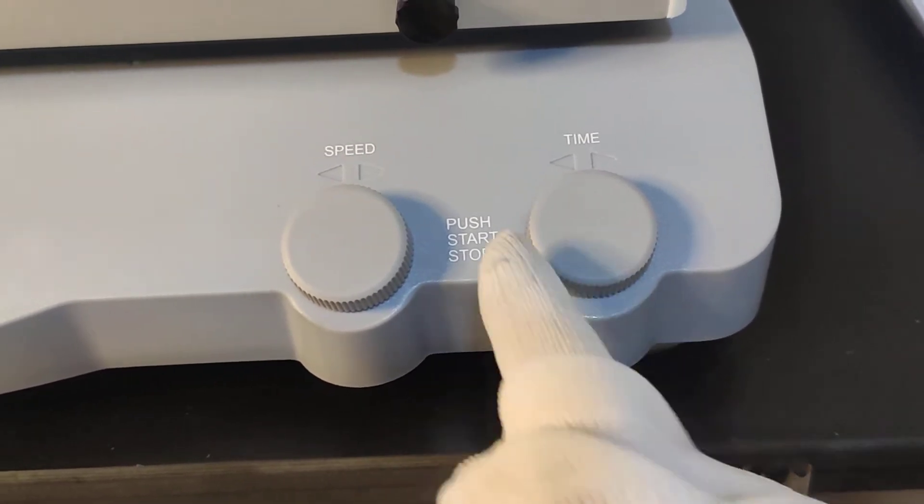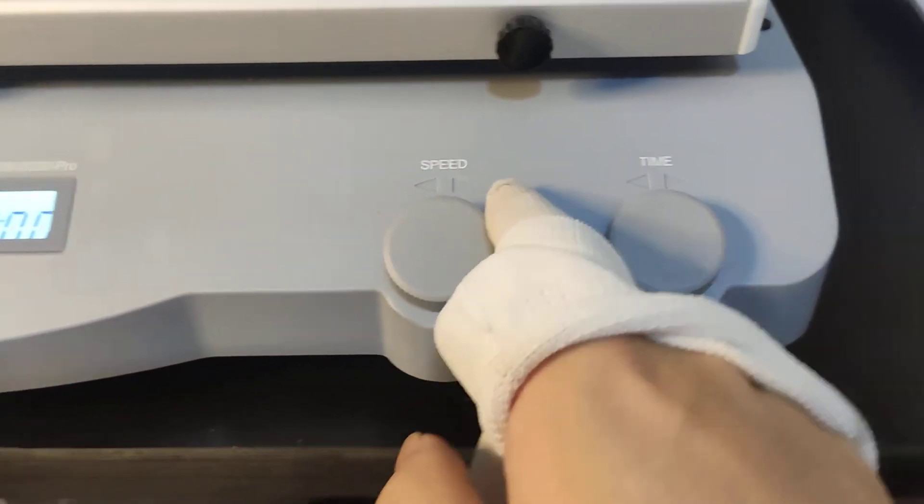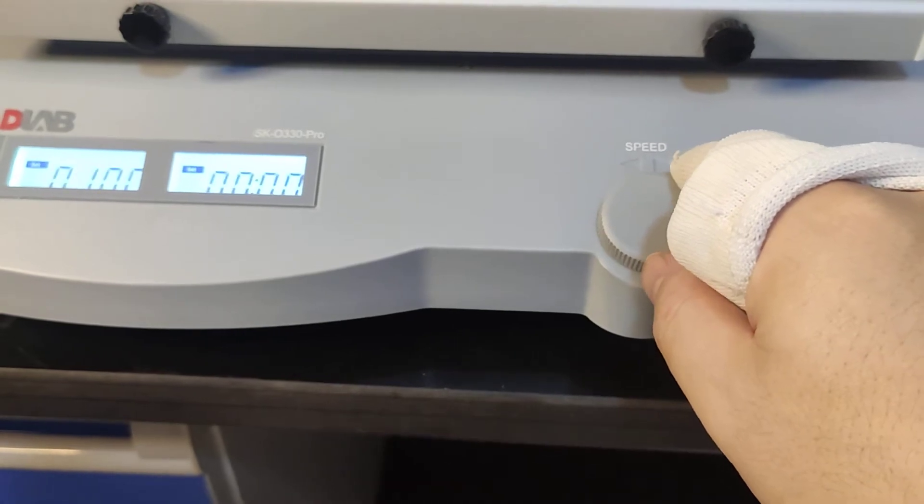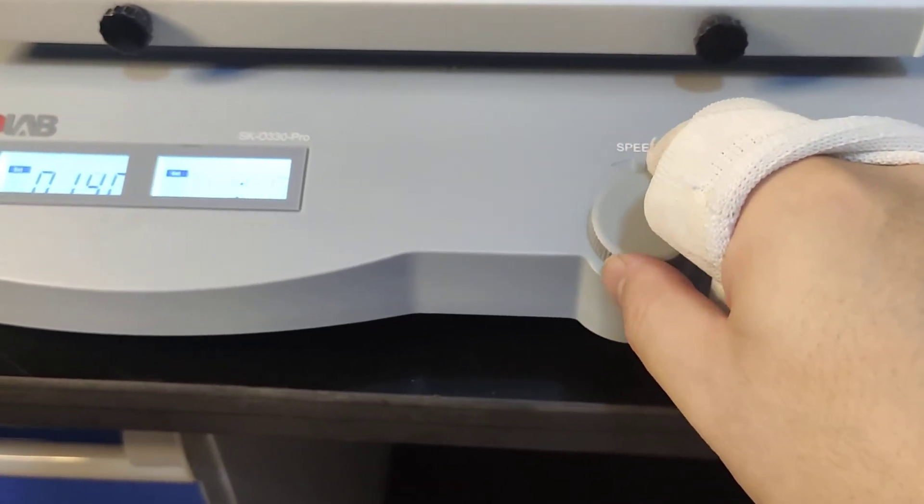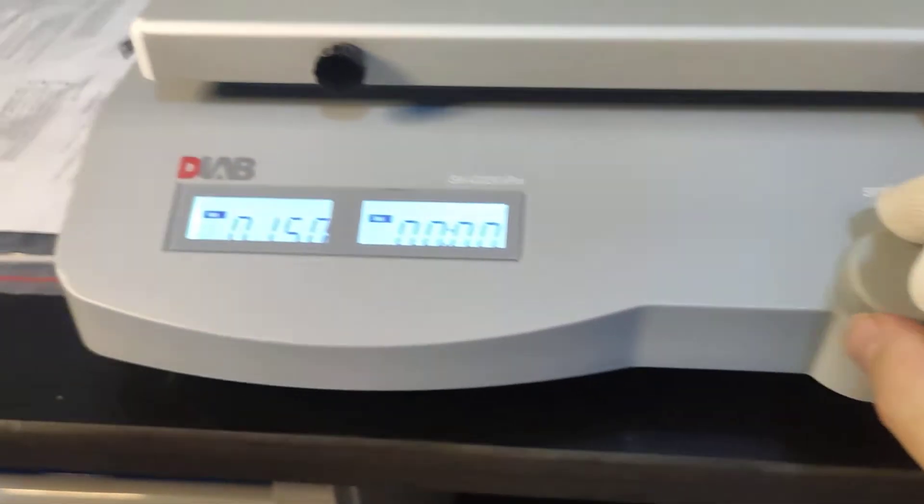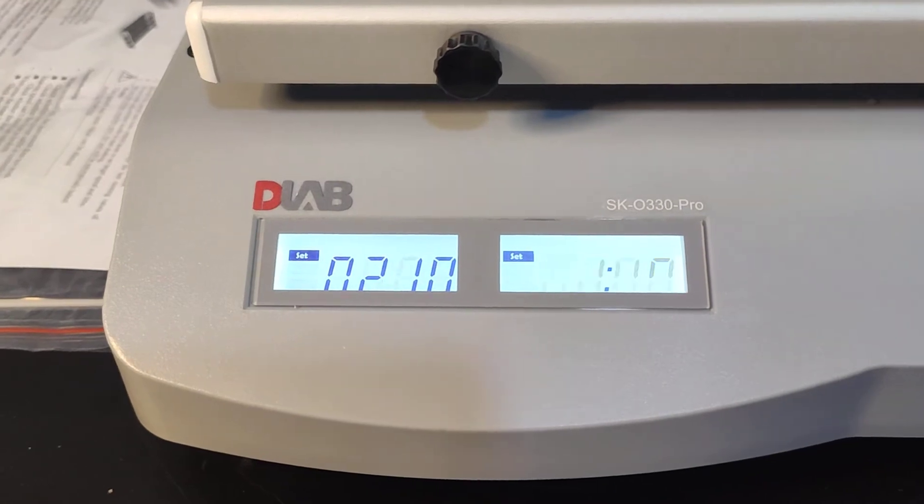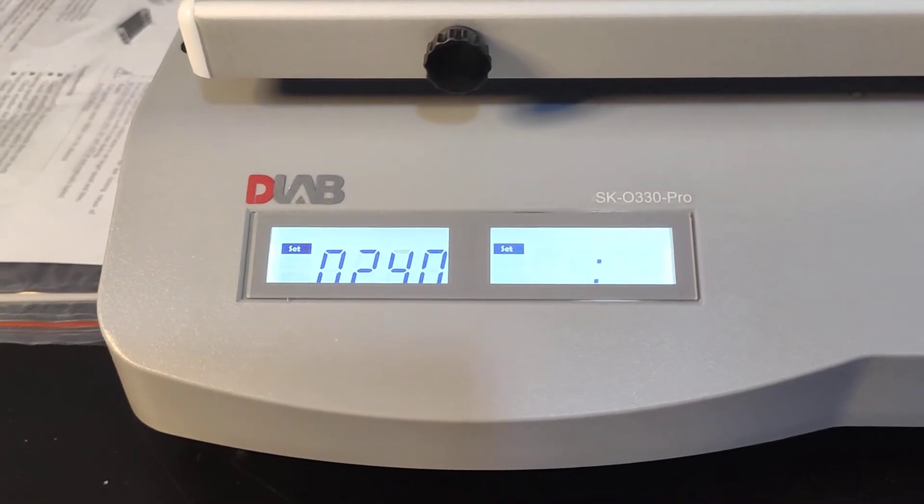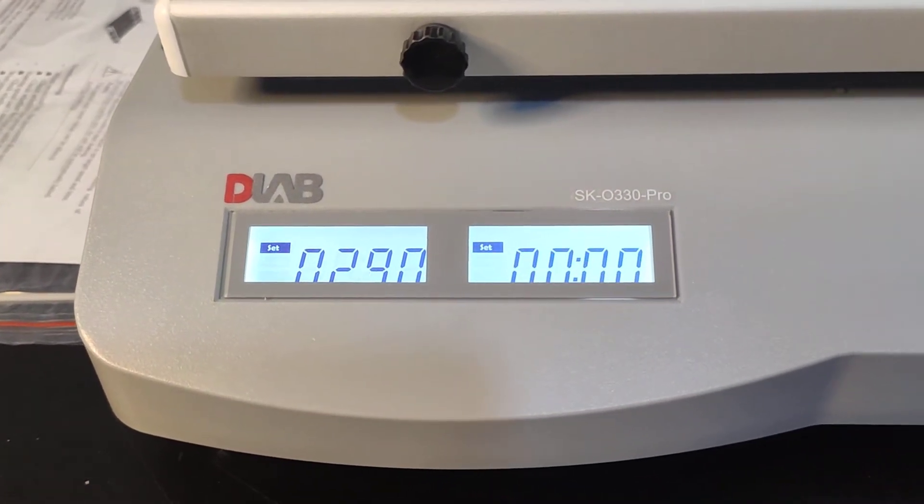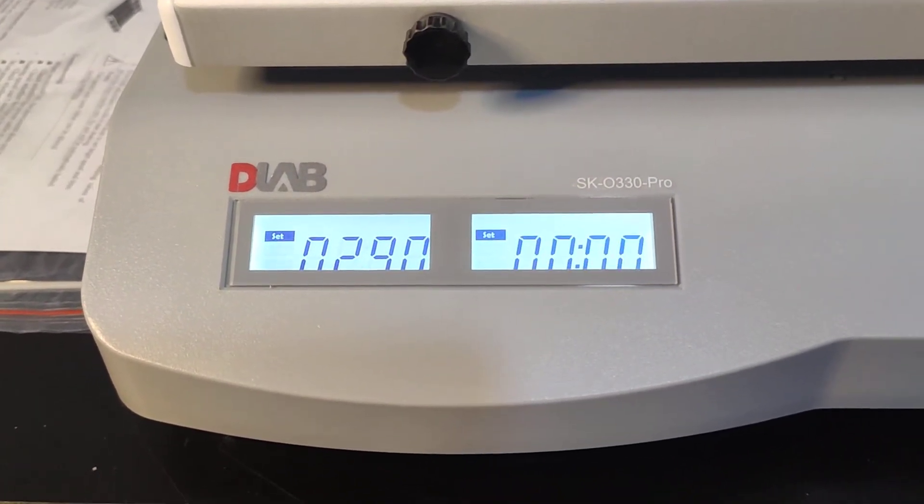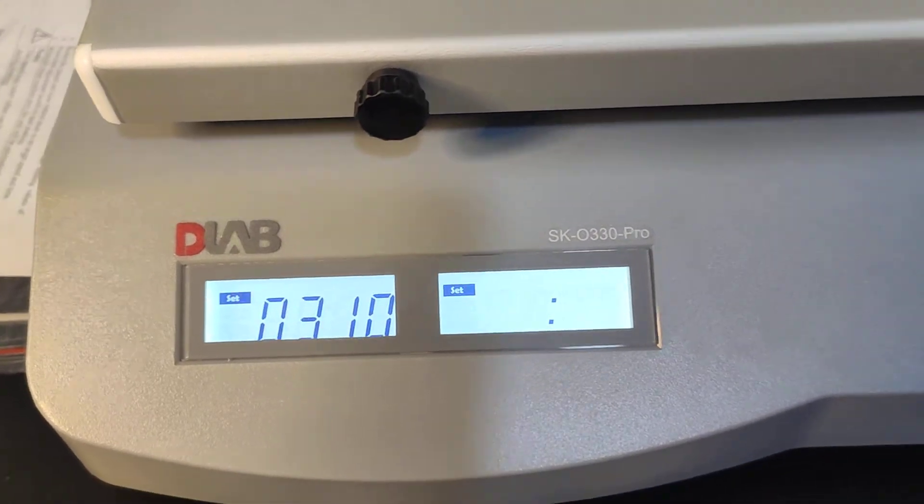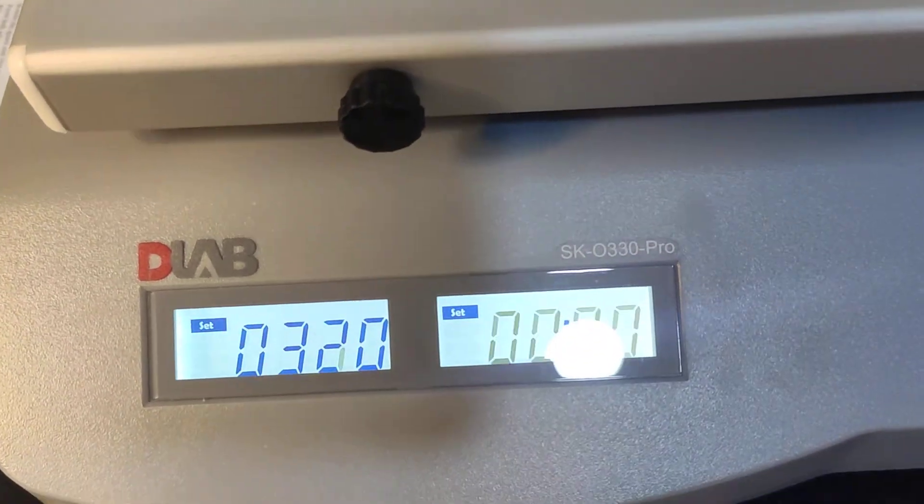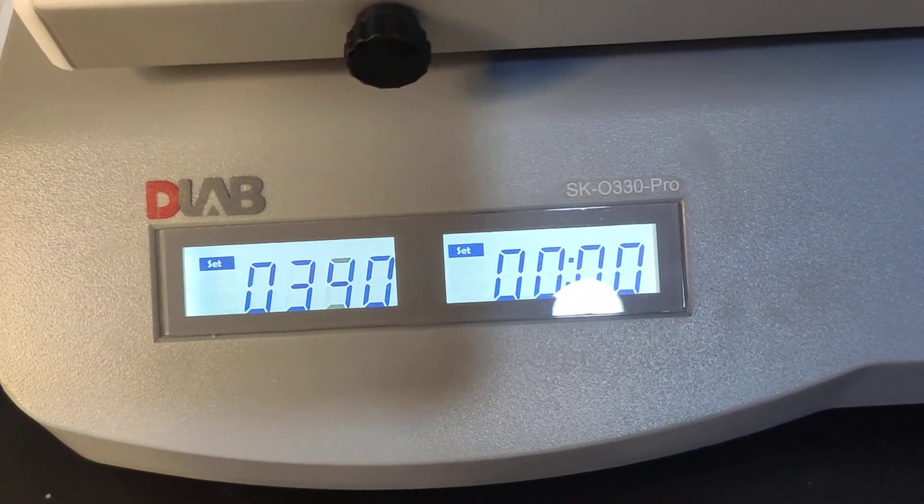If we want to increase the speed, we twist. And we can see that the speed is changing. 260, 290, 310. It is changing.